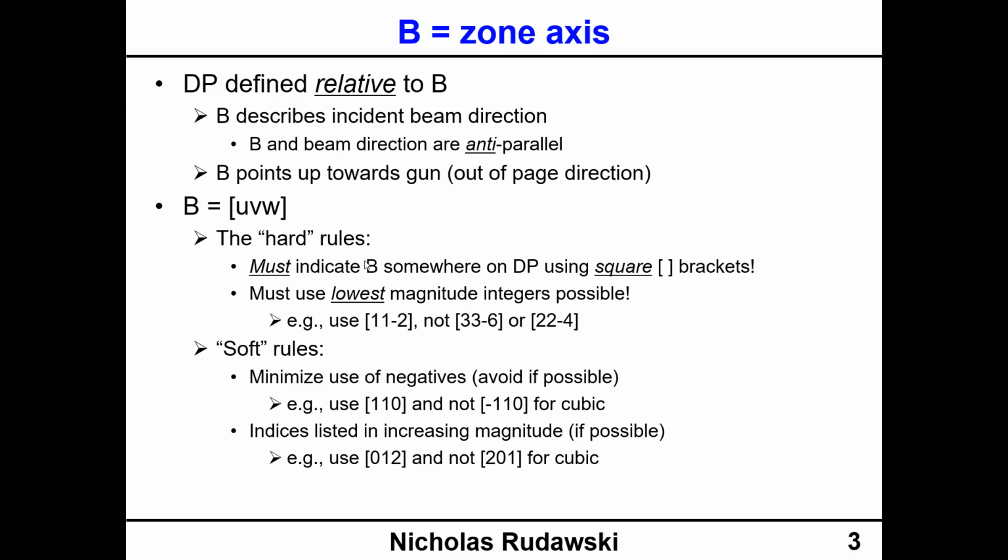It is simple cubic. Over on the right here, I have the list of allowed HKL reflections for cubic crystals. I could have populated this to be as long as I wanted, but I stopped it at 222.